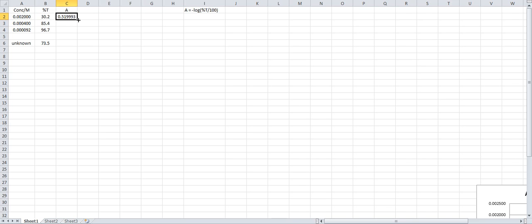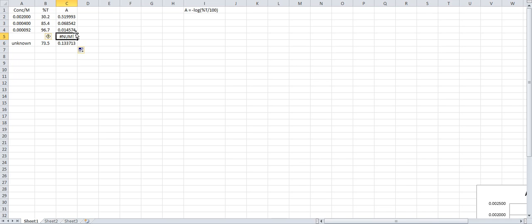You left click, bring your cursor to the lower right hand corner, left click again, bring it down. Now I'm going to bring it down one more time, a little bit further, to get the absorbance of the unknown. And we don't need that, so we'll just delete it.